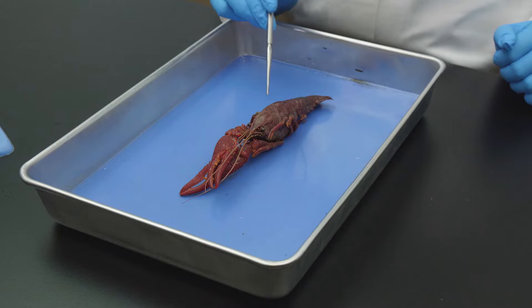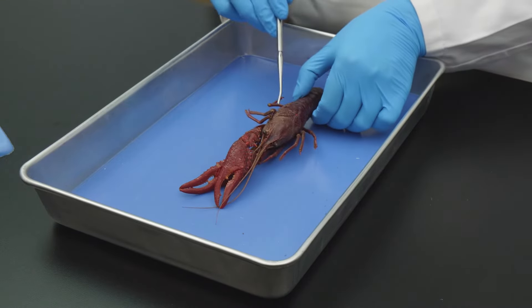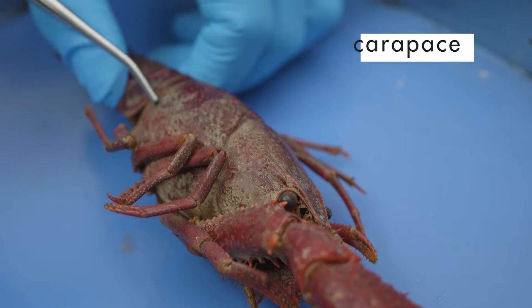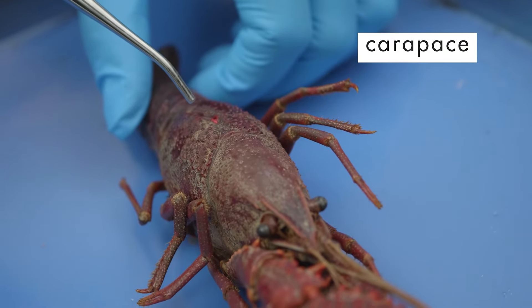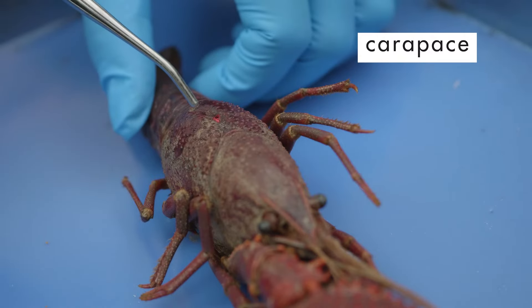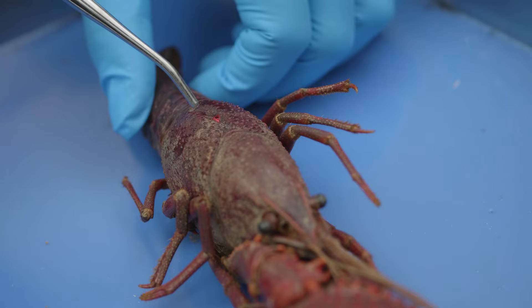The part of the exoskeleton covering the cephalothorax is the carapace. The carapace covers the back and sides of the cephalothorax, but it does not fit tightly against the body. There is a space between the body and the carapace so water can circulate through the gills.